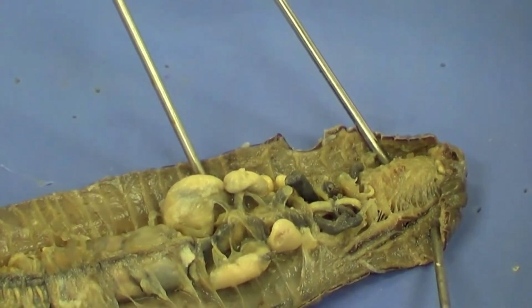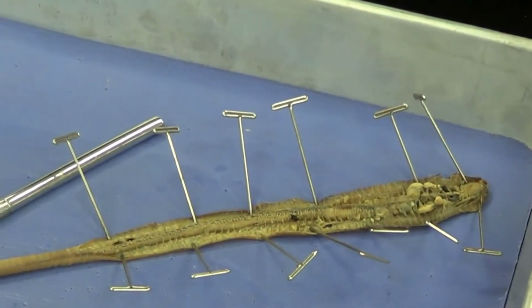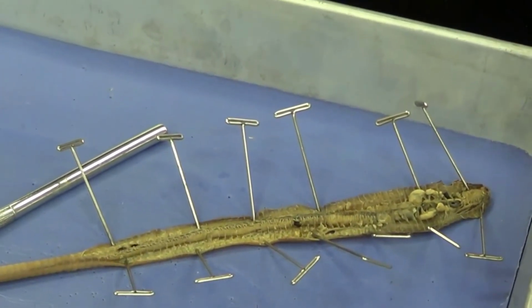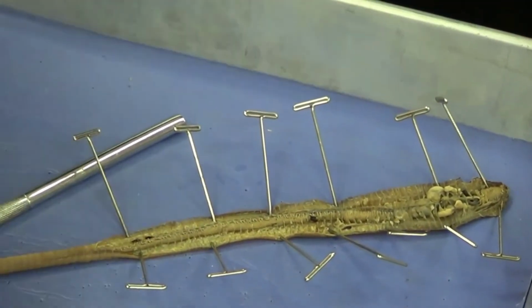Now, if you can get 2 or 3 of those, you're doing very good. You're doing very well. And there should be around 5 altogether. Sometimes a little bit more, sometimes a little bit less. There is no perfect worm.